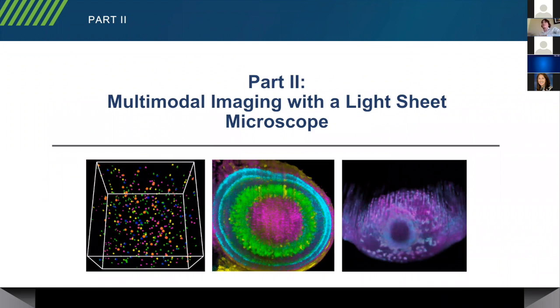Okay, so part 2 is about the light sheet microscope. And here I want to focus on another imaging modality, which is hyperspectral imaging using the light sheet microscope.